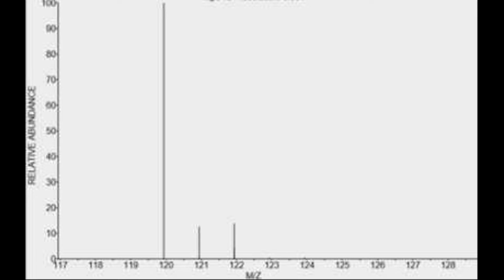By changing the strength of the electromagnet, a mass spectrum will be created by recording the various masses that made it to the detector. The spectrum is easy to interpret, as the vertical line at each mass shows the relative abundance of the substance at that mass.